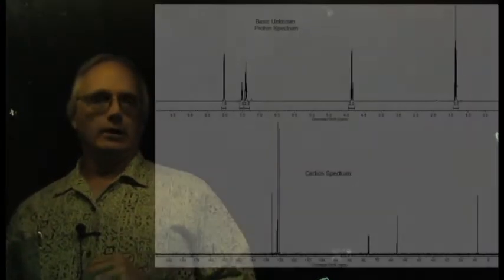So, looking at the set of spectra for the Friday assignment in the chemical shift module, they're on the course website right now, a collection of PowerPoint files. There is a collection of spectra for what I call basic alcohols, and I'll leave those for you guys to work on. But I do want you to look at the set of spectra labeled the basic unknown.